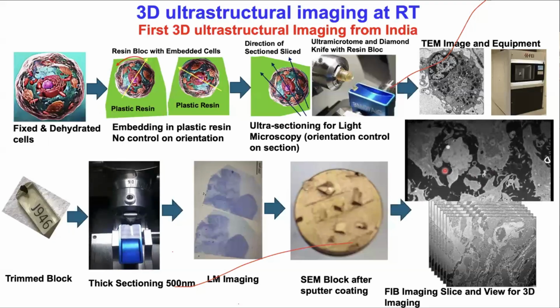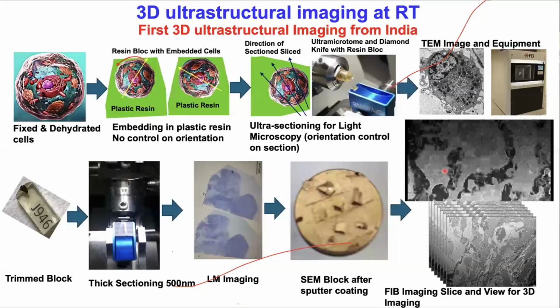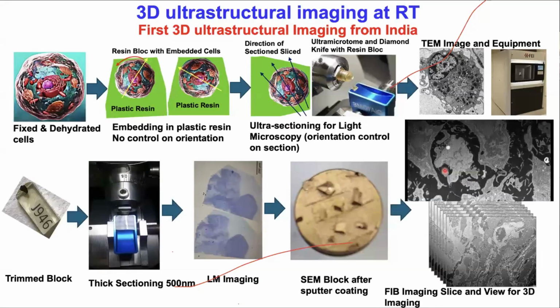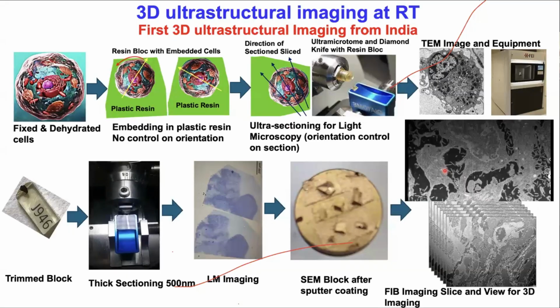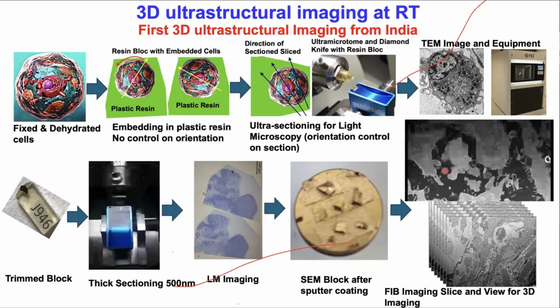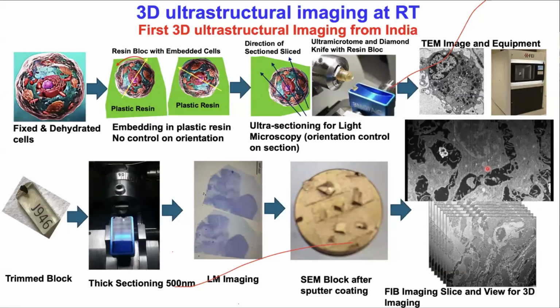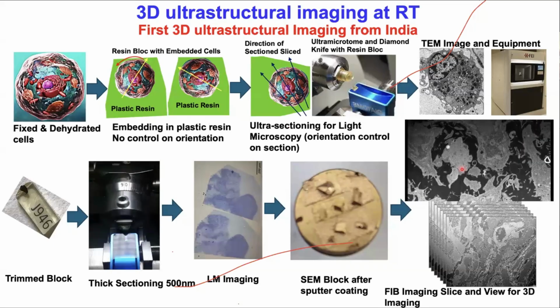In the literature it is known that the virus is going to be cleared at the first stage of the cancer, but even in the fourth stage of the cancer, we could find the presence of the viruses in the intercellular spaces. So this is one of the first indications of applications you can get by using 3D imaging.